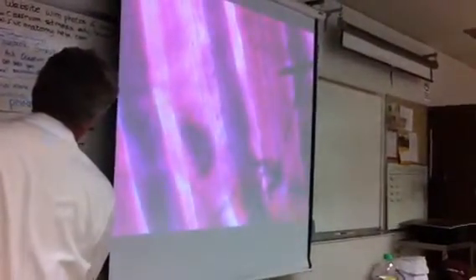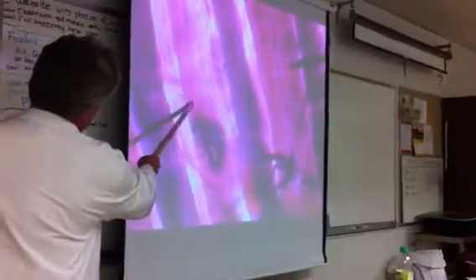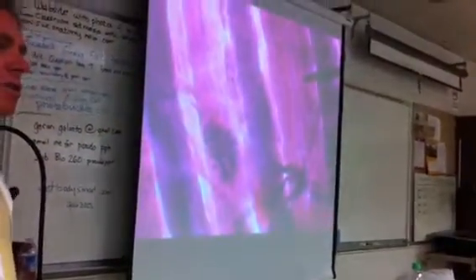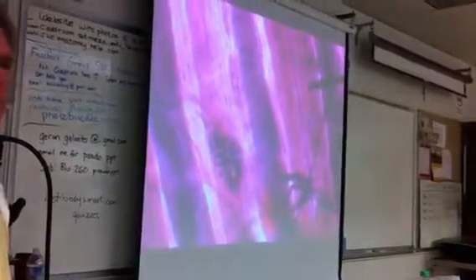Let's see if there's any more of them there. Oops, right there. There's another one there. You can see the nerve fiber there. So it's the neuromuscular junction. It's a pretty simple slide. It's just skeletal muscle and the junction with the nerves. So we got that one out of the way. It's only 4, so it shouldn't take too long.